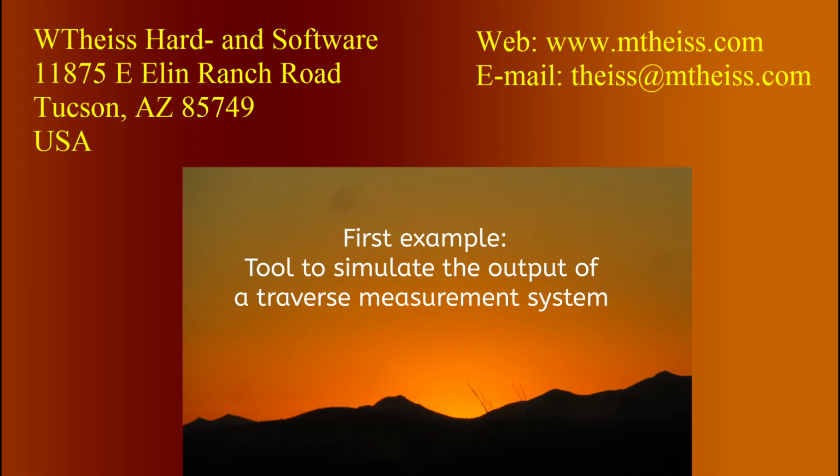The goal is to develop a system that simulates the output of a traverse measurement system, generates the same spectra as if they were measured, and I will use this tool later on in another video when I discuss the bulk analysis mechanism.